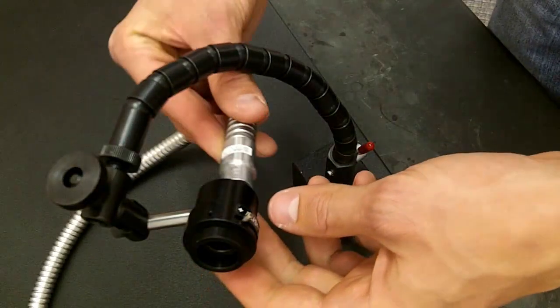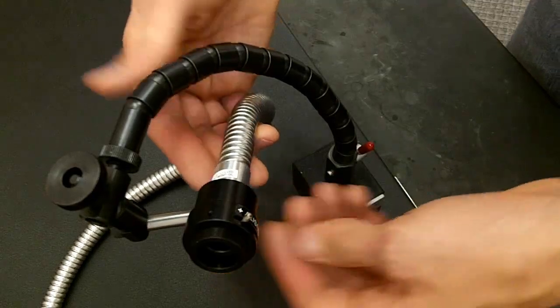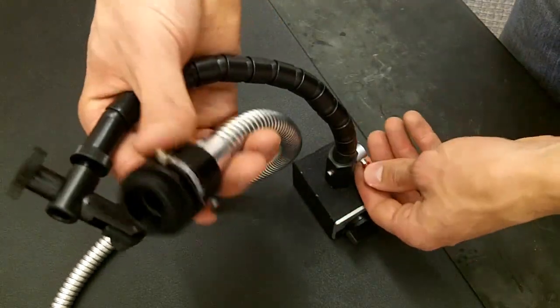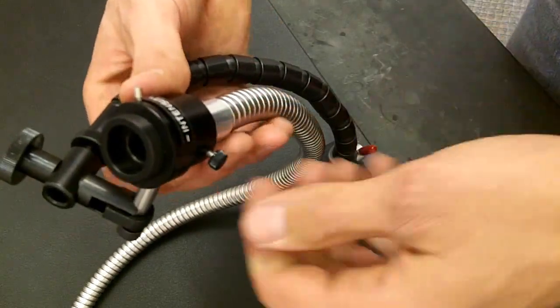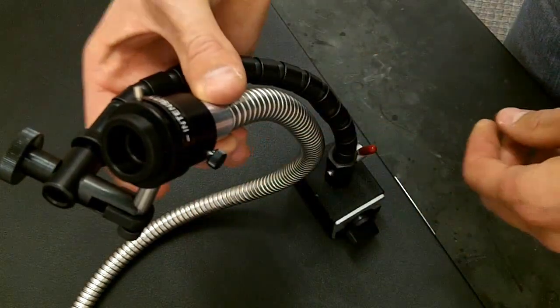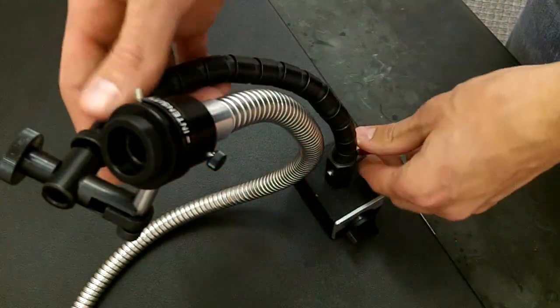Now I'm going to attach the fiber optics to the fiber optic arm. This screw down here just makes sure that the fiber optics are locked in place and won't come out of the fiber optic arm.